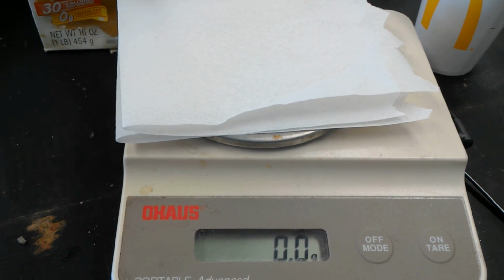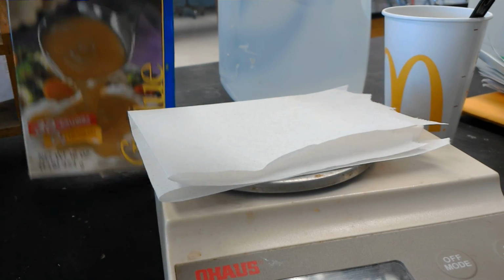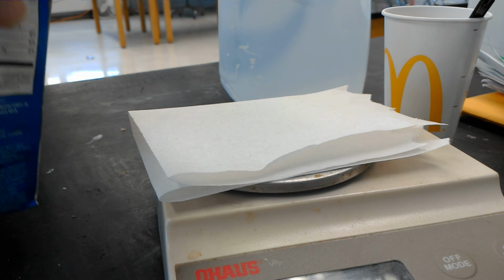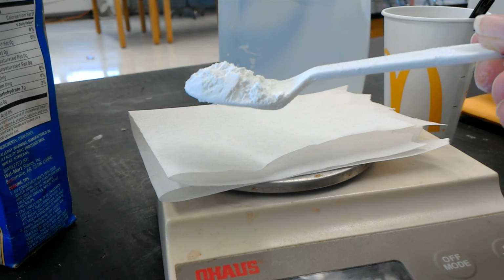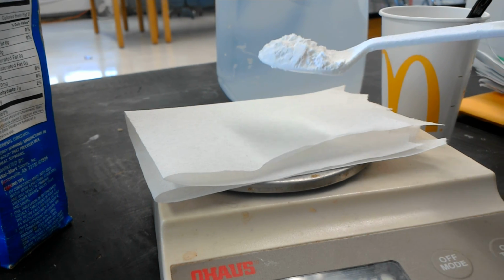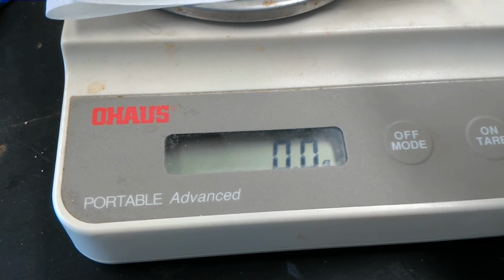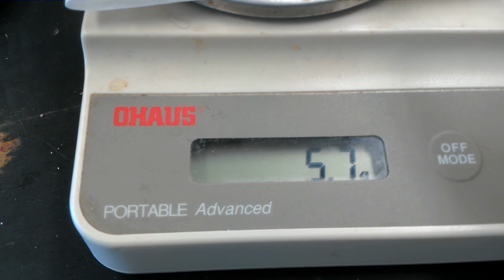So the machine kind of thinks that the paper towel isn't even there. Then we will take the box of cornstarch, and using the provided super fancy science instrument, which is just a spoon, we are going to add small amounts of starch to that paper towel until we get the appropriate amount, which is about 8 grams.